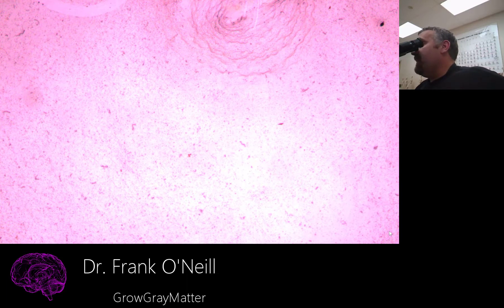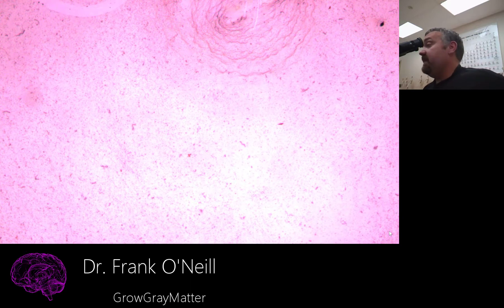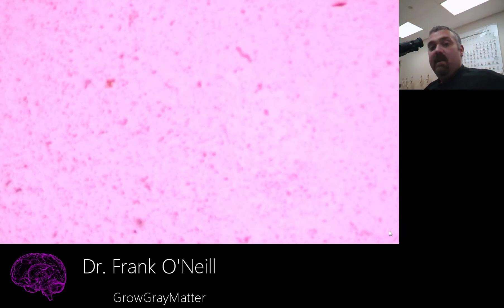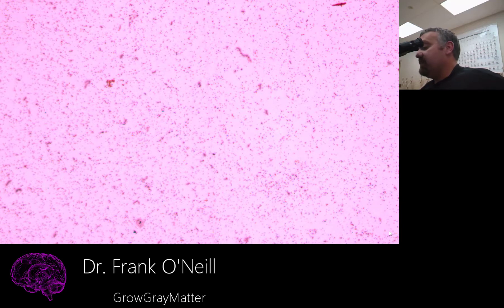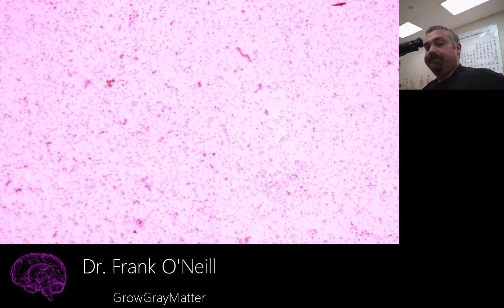I've done my Goldilocks testing and focused in both directions the best I can. This is the scanning power — the 4x objective with a total magnification of 40 times — and now I'm going to jump ahead to low power and tweak things a little bit. I like to look through the microscope, but these cameras can be sensitive to the amount of light you put through them, so I need to do a little bit of tweaking.